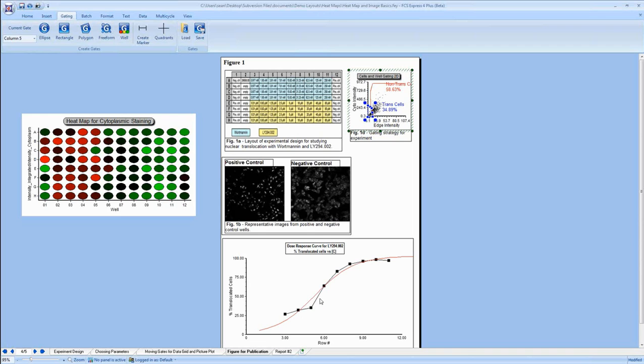And what I want to show you is that we can do very nice, very beautiful regression analysis, especially when you're working with imaging data that has multiple fields of view per well, or if you're working with flow cytometry data, which inherently usually has a lot more cells.